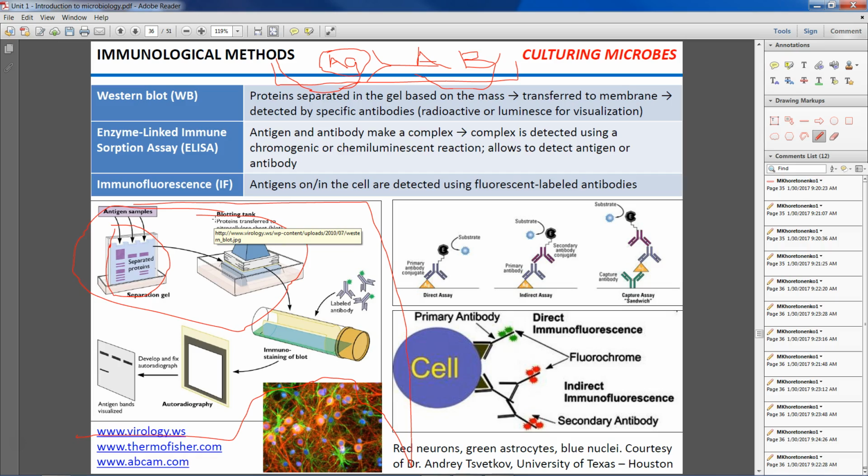Which ones are going to go faster? Which ones are slower? Smaller will go faster, right? Look at any football team. The complexion of wide receiver versus the center or the offensive tackle. Okay, so smaller will go faster, and smaller they go from top to bottom, so smaller will be on the bottom, bigger will be on top.